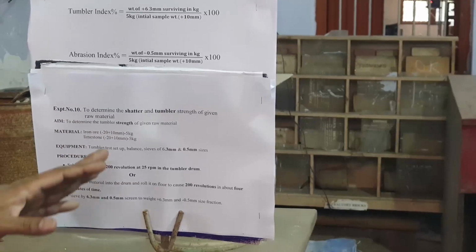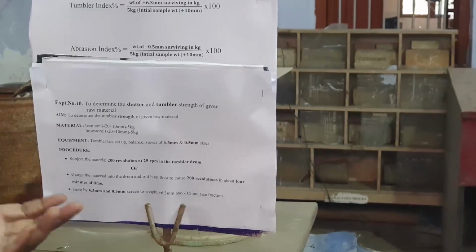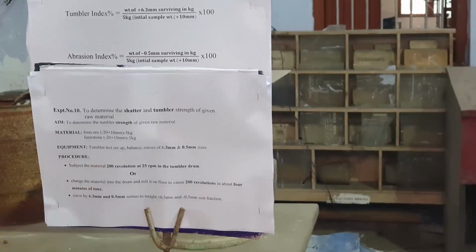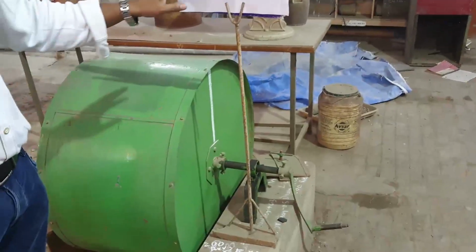The quantity we are taking, instead of 15 kg, we are taking 5 kg because of laboratory purposes. We don't have that much material, that's why we are taking less quantity, 5 kg. Generally we can take 15 kg. So what equipment is required? The tumbler test setup is there, and a balance is required to weigh the raw materials.